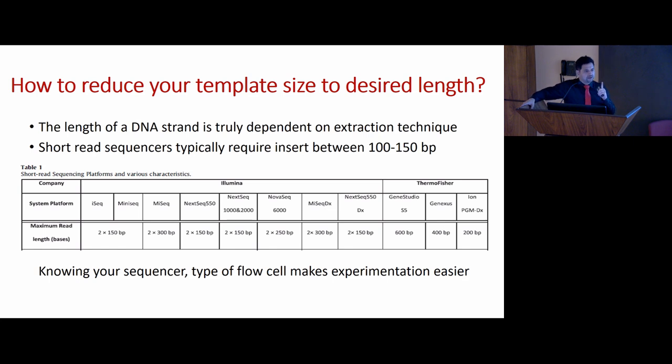based on leader, the primers are based on leader sequences. Or if you want to do, let's say metagenomics, where you want the full length of the V1 to V9 gene, or you are trying to do FLT3 ITD detection, which is very accurate. It is largely dependent on read length. Even there, a large read length machine is important.